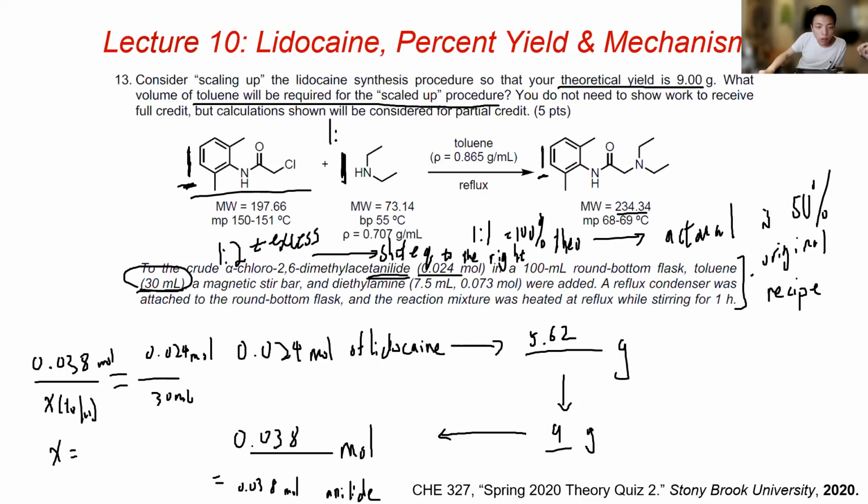And for 1-to-3, other than shifting the equilibrium to the right, we also have to make up the loss of the diethylamine when the HCl was generated. So theoretically it's 1-to-1, but there are also other cases that we might encounter, and that's why we want to use 1-to-3.